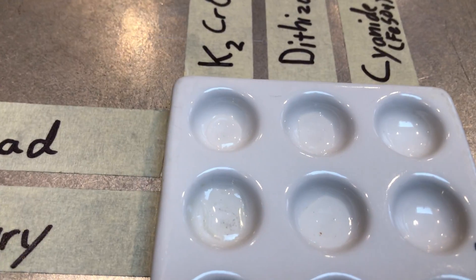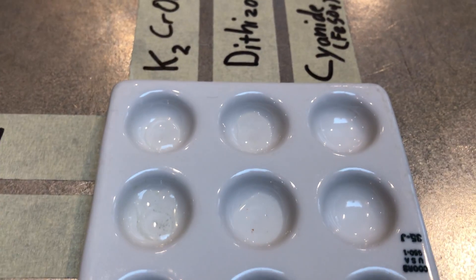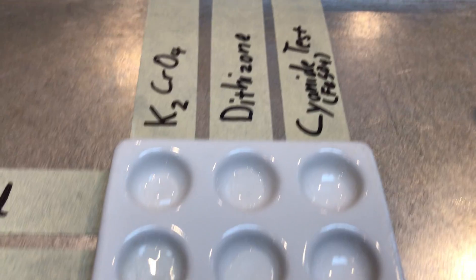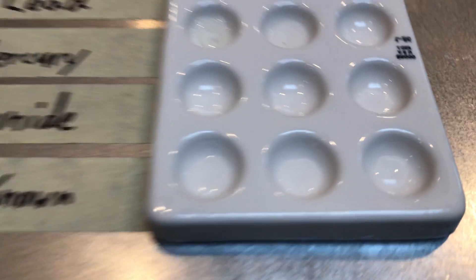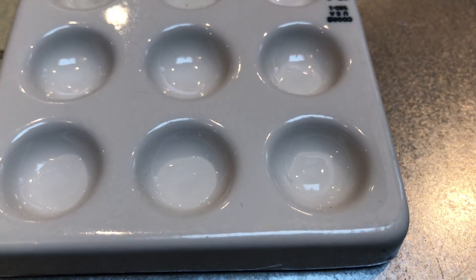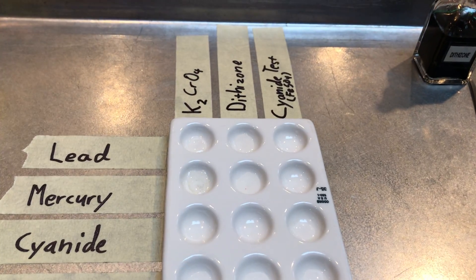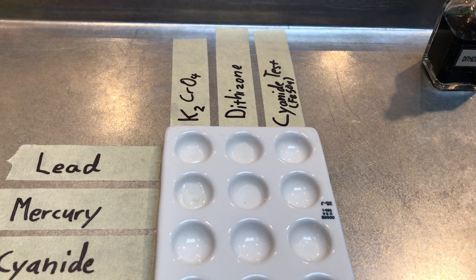We've already placed our poisons into the wells — the lead and mercury into the wells where we're going to add the potassium chromate and dithizone. Our cyanide goes into the well for the cyanide test, and our unknown goes in all three of the wells. So the first thing we're going to do is test our known poisons lead and mercury with potassium chromate and dithizone.